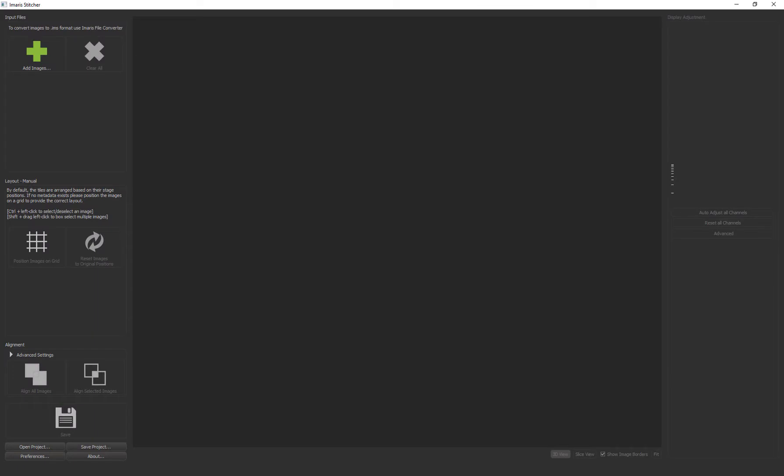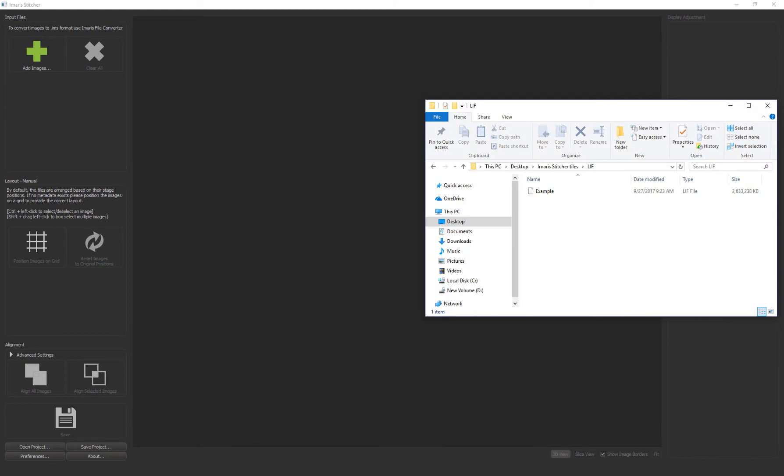First I'll start Imaris Stitcher. I want to load a lift file which contains tiles that make up three images. Because Imaris Stitcher only accepts Imaris files, the best way to handle other types of files is to either convert the file ahead of time with Imaris file converter or drag and drop the file into the Imaris Stitcher window.